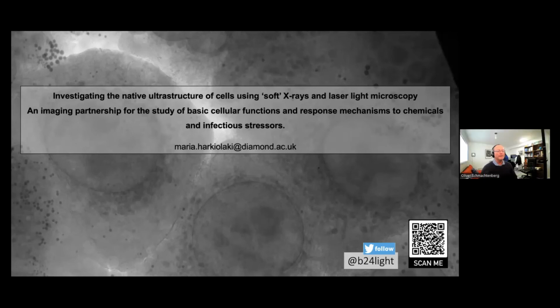Okay, so no cryoprotection necessary. No, cells have a natural cryoprotection, it turns out. Coming from a crystallography field myself, it felt unusual, but yeah, absolutely. If you keep them at a reasonable density of above 60%, they experience very little disruption. And to be honest, from the electron tomography people that sent us very, very dry, very highly blotted grids, they're very resilient.